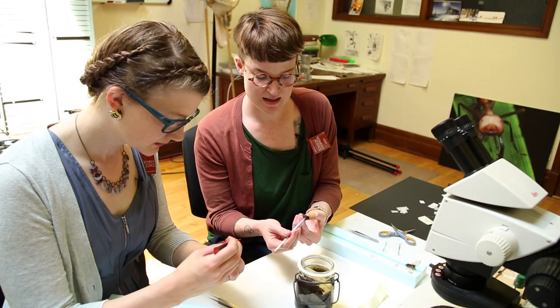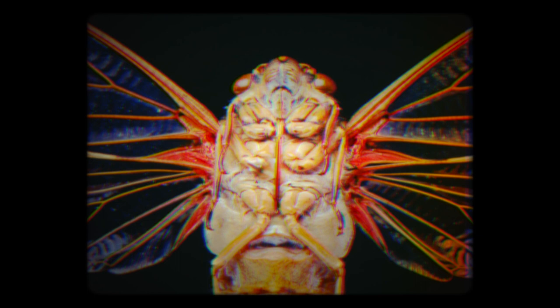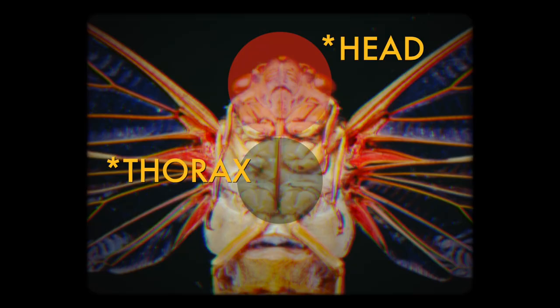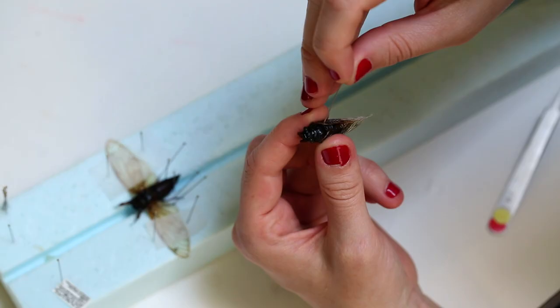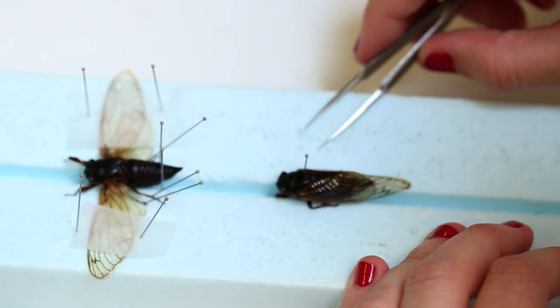After getting the legs settled, the next step is getting the pin through the insect. All insects are roughly made up of the same sections: the head, the thorax — where all the legs come off — and the abdomen. For almost all insects, you want the pin to go through the upper right-hand part of the thorax.